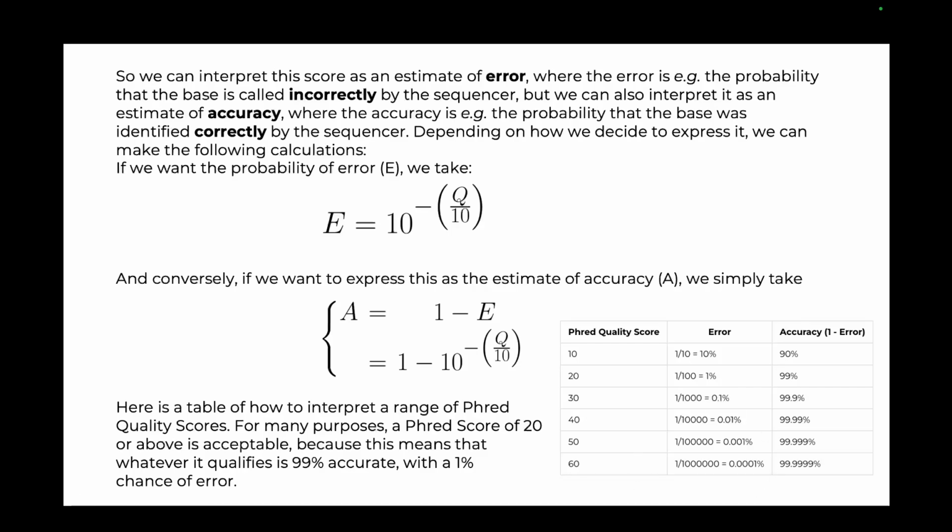So for each base called by the base caller, there will be a quality score assigned to that particular base. And seeing that quality score, you can have an idea of the probability that that particular base has been called wrongly, because the sequencing machine can get things wrong. So that is part of the job. You need to have an idea about how much wrong it is. If it is a 50-50 thing, you would not take that base into consideration, right? Because it will have a higher chance of error.